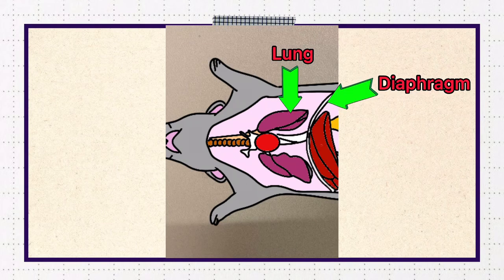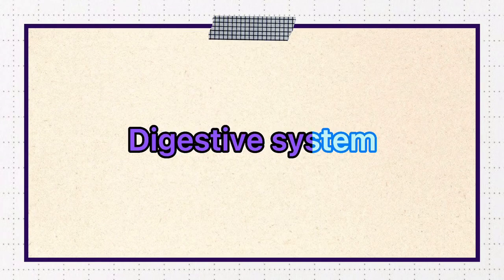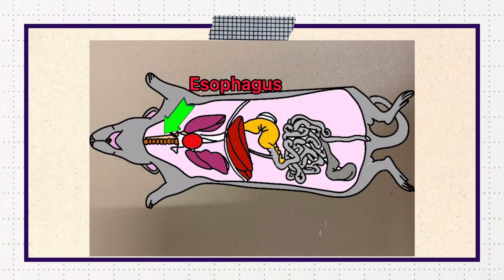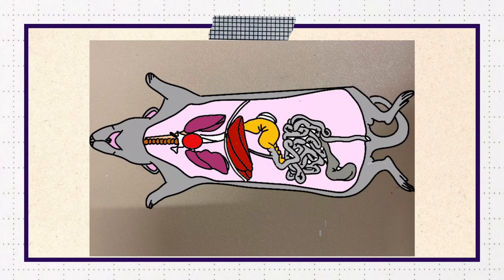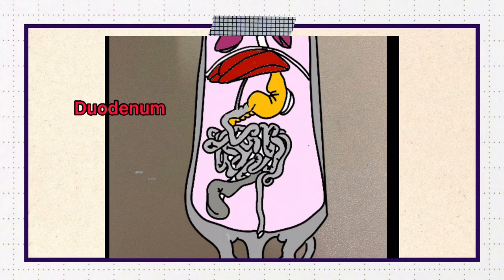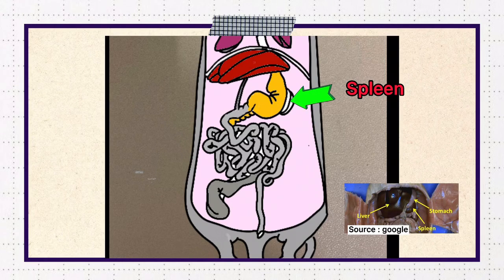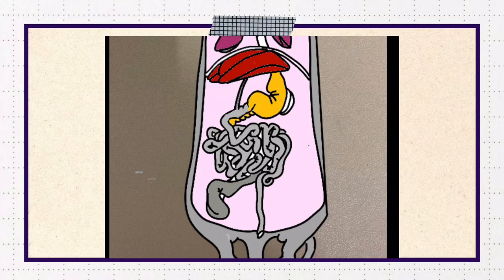Moving to the digestive system, there is the esophagus which runs through the diaphragm and moves food from the mouth to the stomach, the bile duct which carries bile from the liver and the gallbladder to the duodenum, the stomach on the right side just under the liver, and the spleen which is about the same color as the liver and is attached to the greater curvature of the stomach.